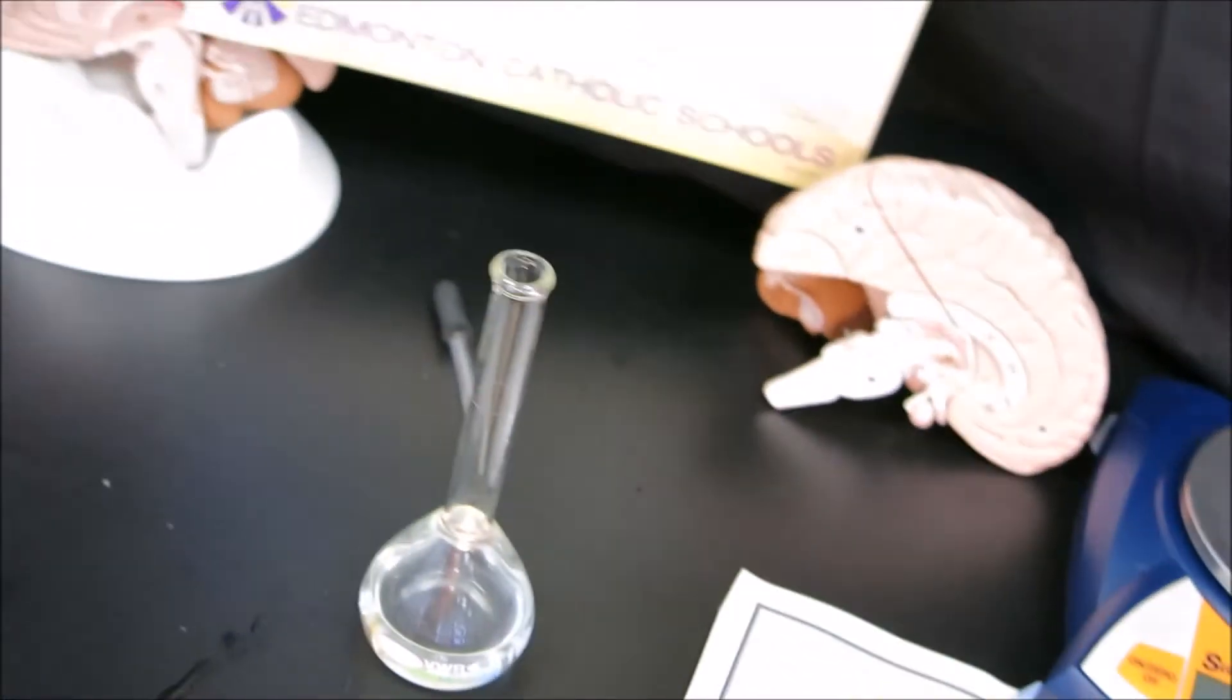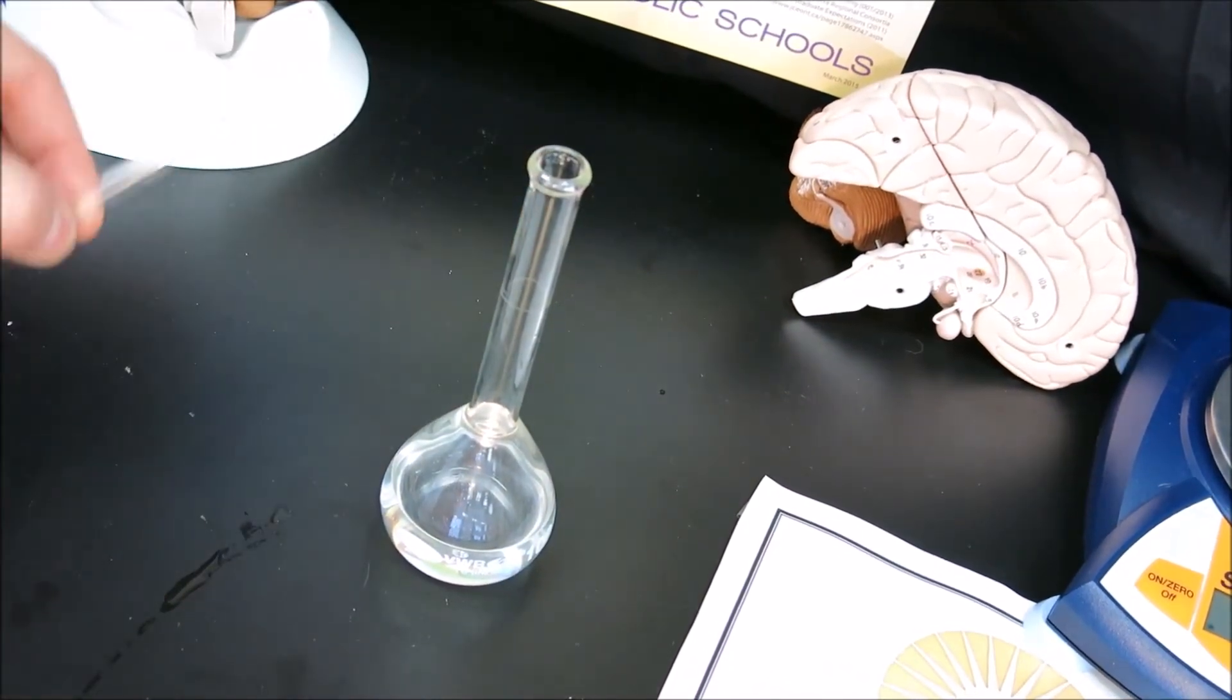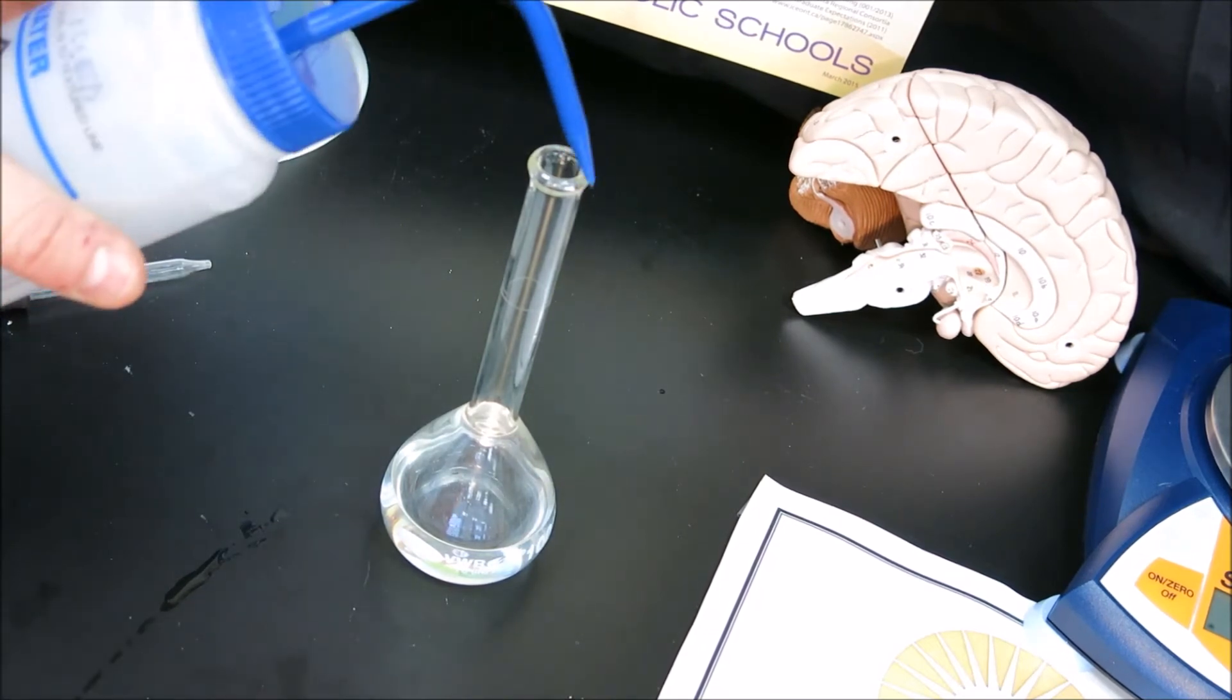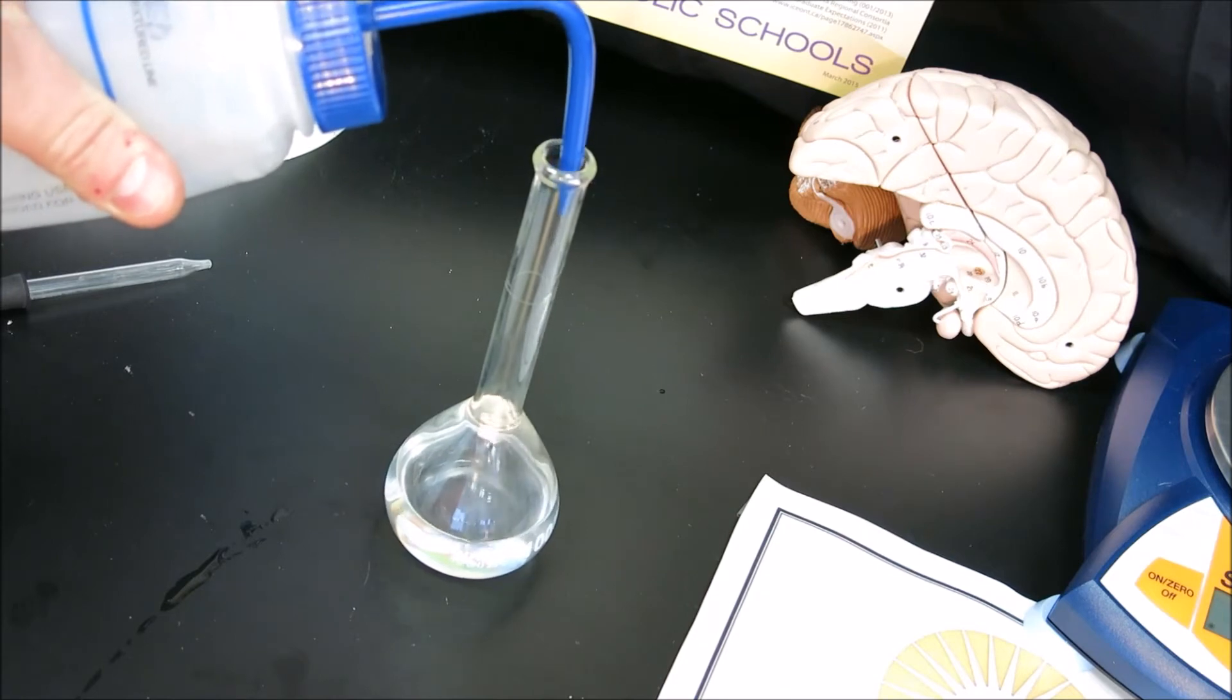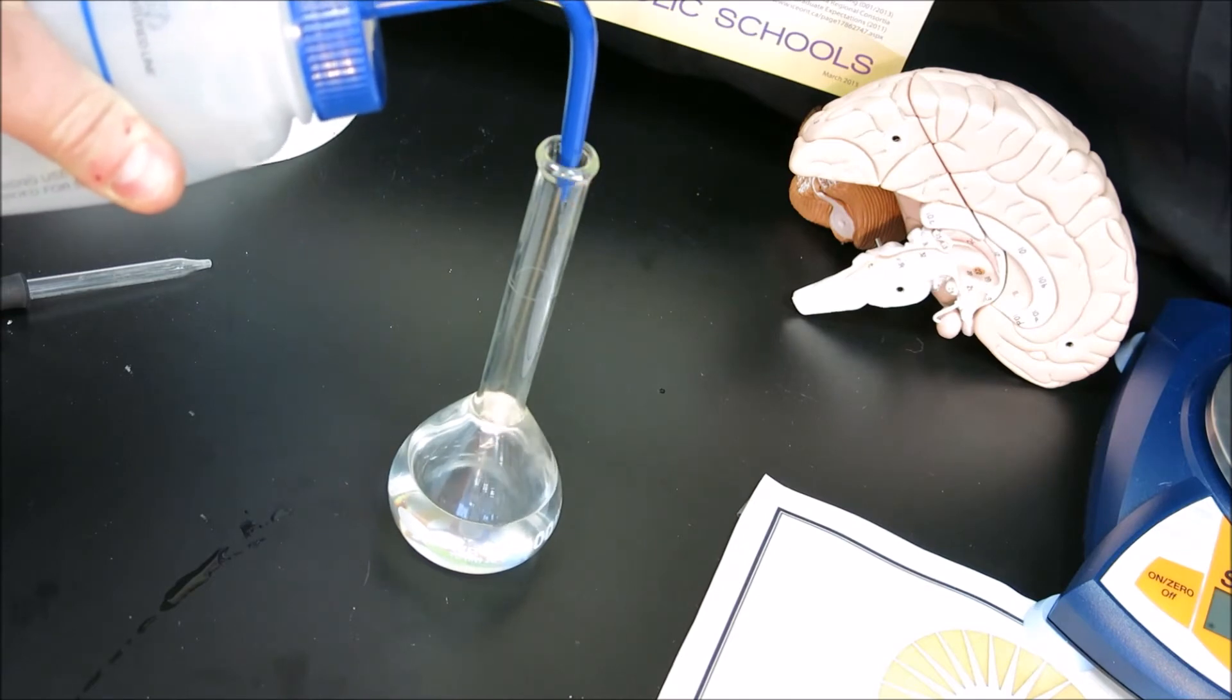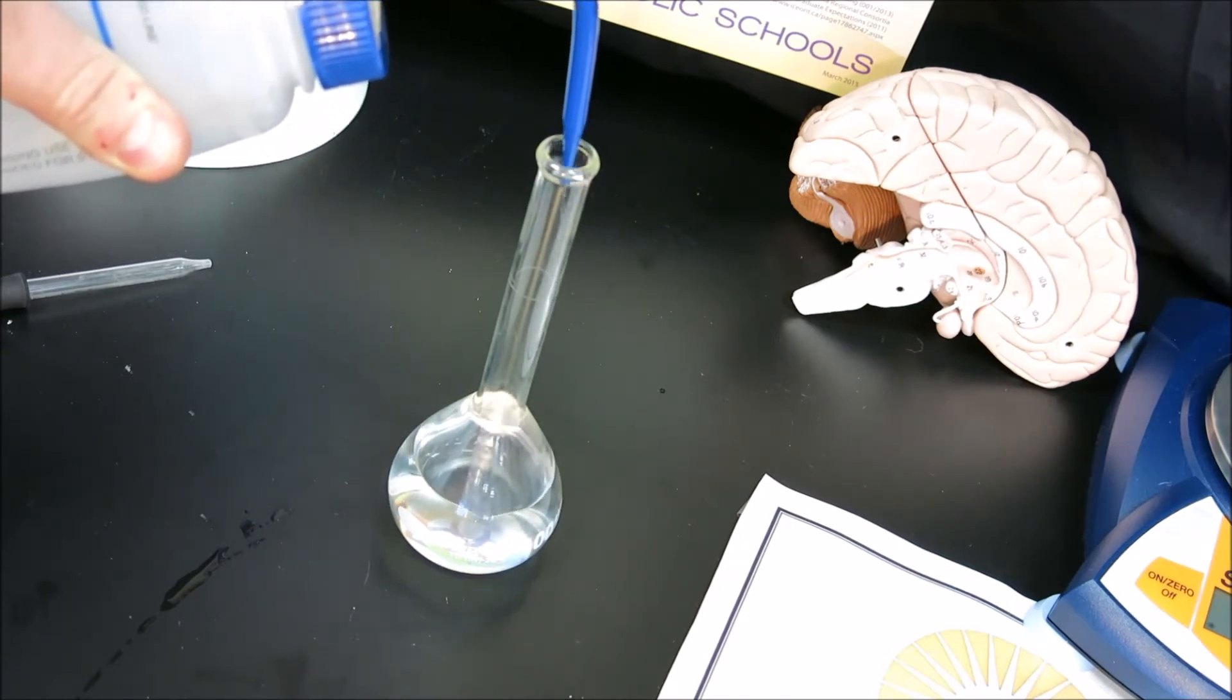To do that, we'll use a distilled water bottle, and at the last stage, an eyedropper if we need to get the meniscus to the line. One risk of filling is as soon as the liquid starts to enter the neck, which is very narrow, the level of fluid will rise very quickly compared to the level in the bottom part of the flask.